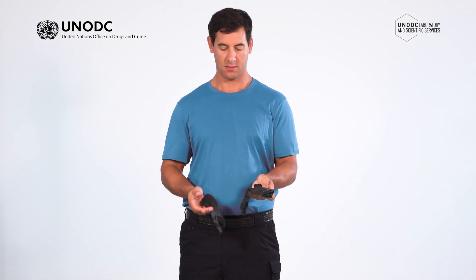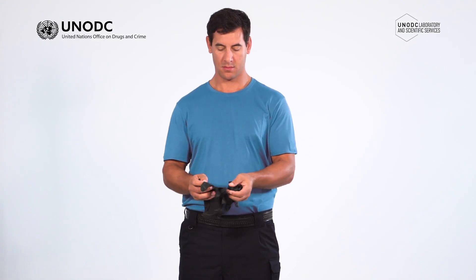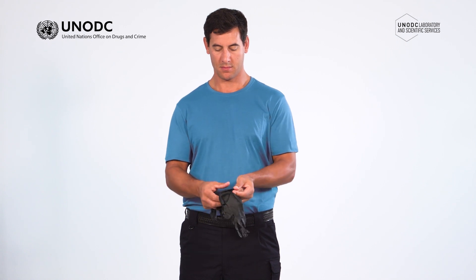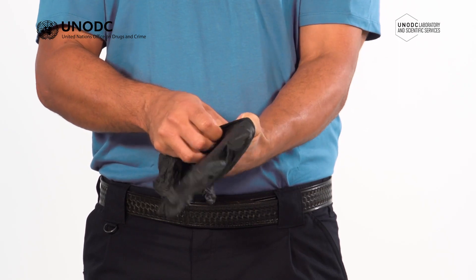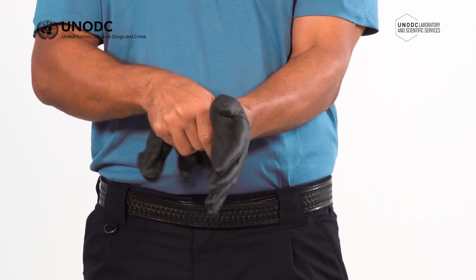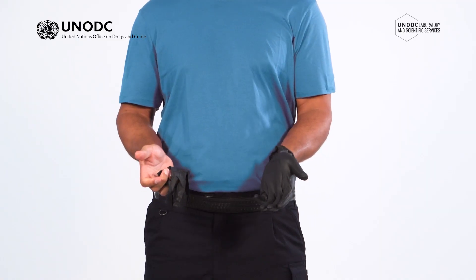Before putting the gloves on, always undertake a visual inspection for any defects or damage. Insert one hand into the first glove and pull the cuff of the glove up to the wrist, making sure the cuff is fully extended and the wrist is covered. Repeat this for the second hand.